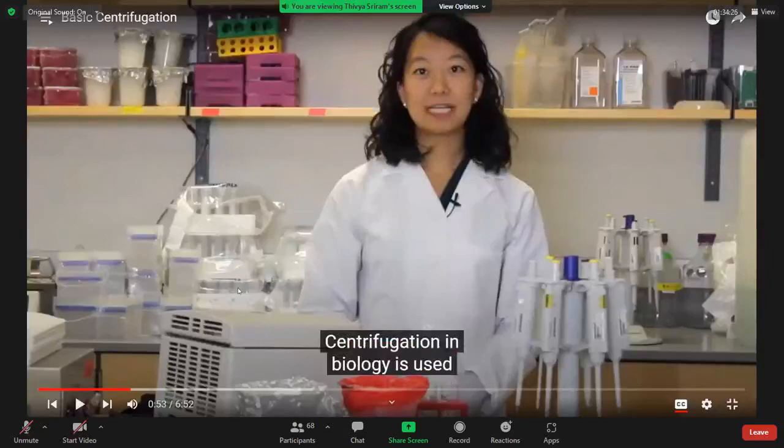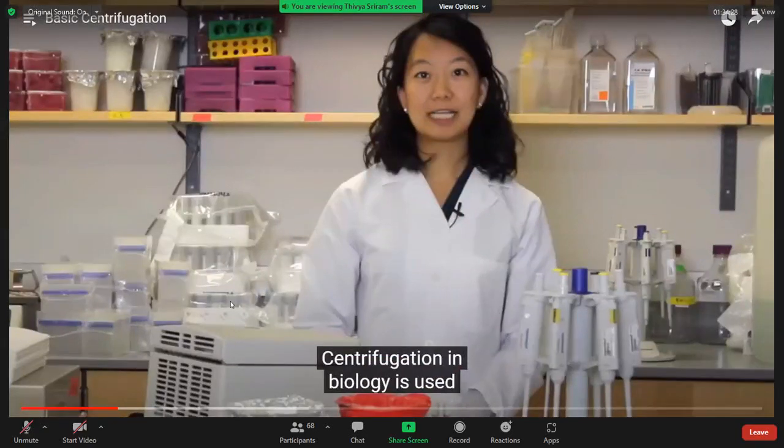So here, due to centrifugal force, the solid sample will get into the bottom part of the tube. Likewise, the liquid part will be gathered in the upper portion of the particular test tube.